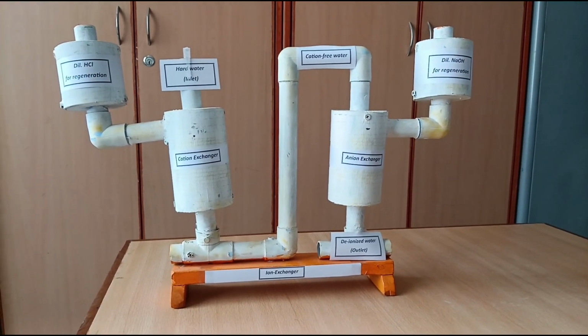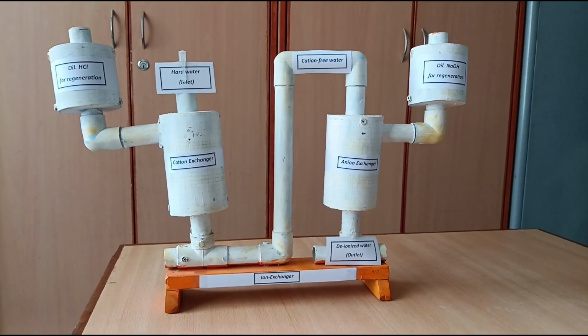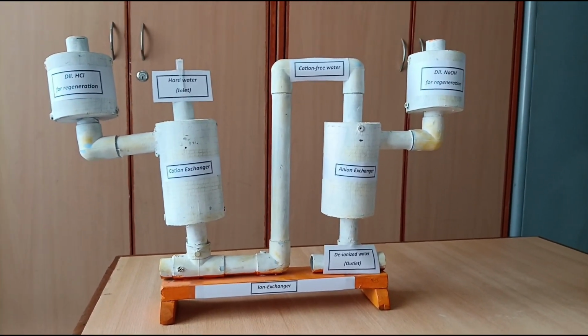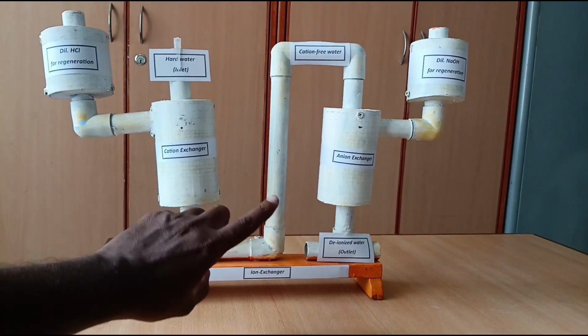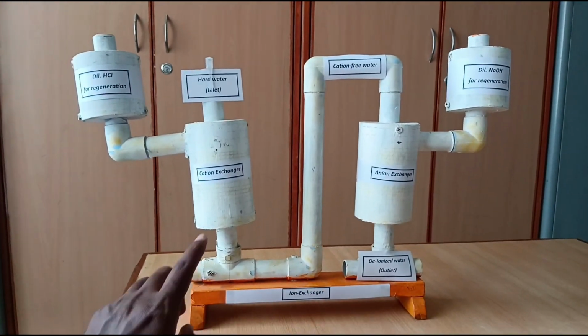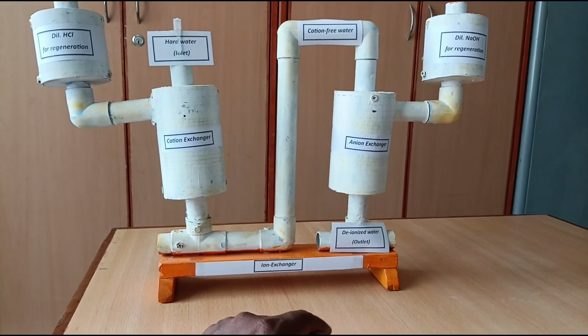Now, let's see a demo for this ion exchange process. This is a simple setup to understand the concept of ion exchange process. This contains two ion exchanger columns. One is a cation exchanger and another one is an anion exchanger.